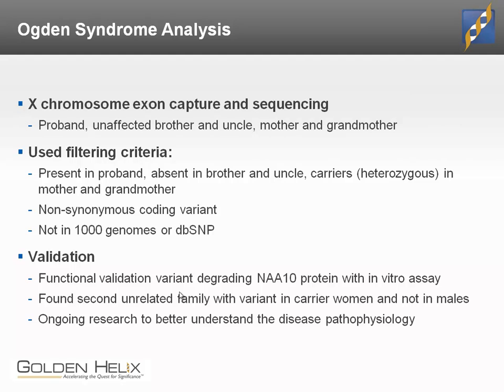So we're going to use best practices because we want to really imitate the idea of an open, transparent set of processes that anybody could pick up and that a clinical setting would try to use as well. To do that, let's compare and contrast what we'll be doing with what was done in 2011 based on the annotations and tools of the time. It is worth noting before I go into much detail that although I talk about the filtering process as if it was only one, Gholson also did a number of different validations within his own study by approaching the problem from a couple of different angles to make sure that we were always concordant in the conclusion.